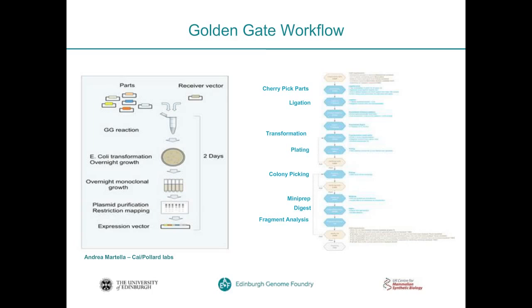And then after this, before we ship it off to the customer, we apply quality control, or QC, by subjecting the purified DNA to an analytical digest and capillary electrophoresis. This is what is referred to on this diagram as digest and fragment analysis. And assuming that the DNA passes QC, we then happily ship it off to our waiting customers.